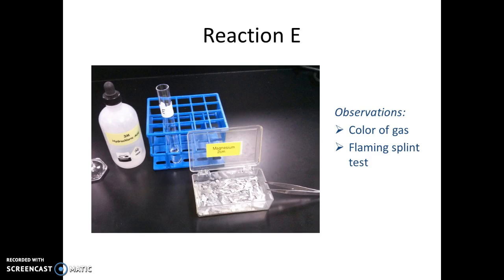Like all the other splint tests that you do today, you're looking to see whether the splint stays lit or whether it goes out. Be careful to listen to see if you hear a loud pop, and remember, if you hear that pop, that indicates that the gas is very flammable. The pop represents a mini explosion where all of the flammable gas reacts quickly.